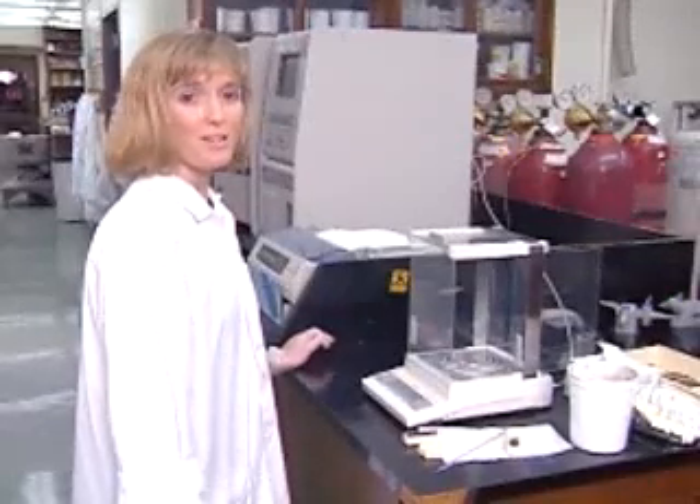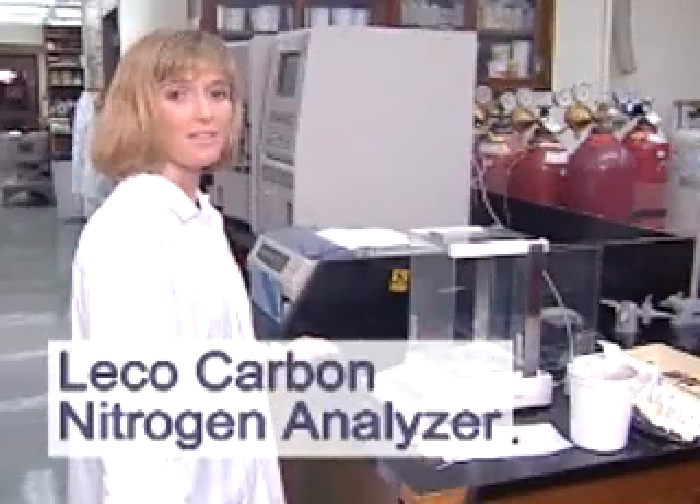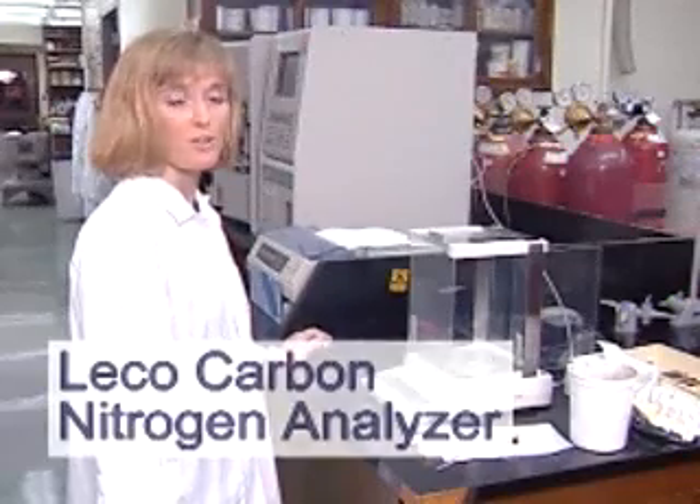This is another method for determining total carbon. It's called the Leco Carbon Nitrogen Analyzer. The beauty of this instrument is that it analyzes for total nitrogen at the same time as the carbon.